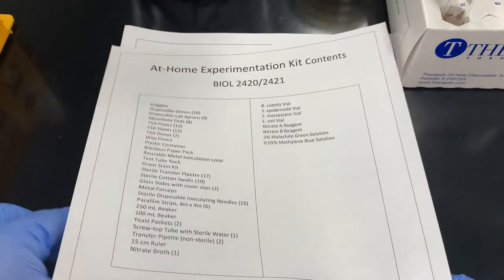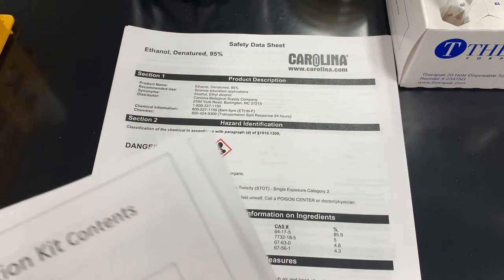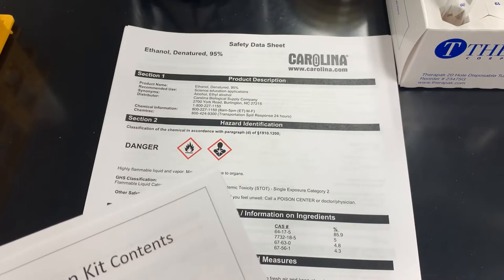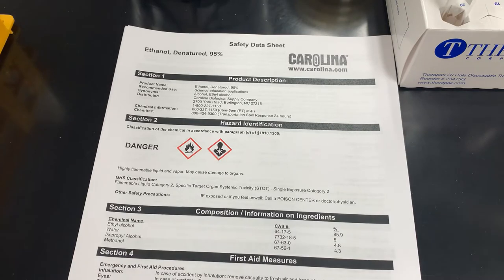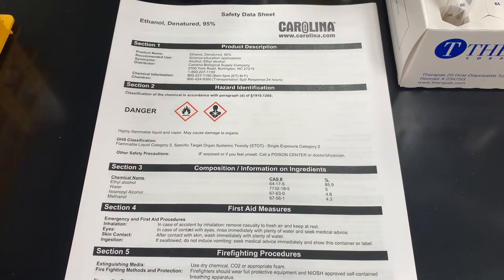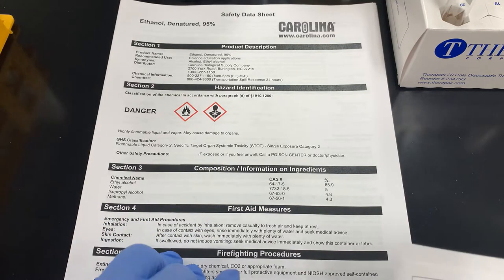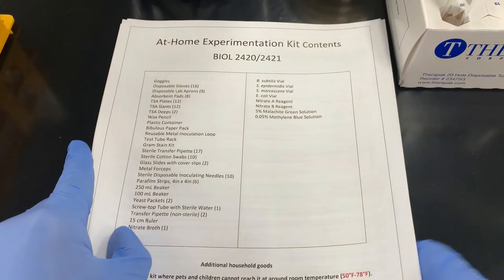After that, you're also going to find the safety data sheets for all of the chemicals in the lab kit. Now, these are also going to be available online, okay? But if you need, here's a paper copy. Specifically, if any of this gets on your skin or in your eyes, they have a section specifically for how to deal with that, okay? Spoiler alert, it usually is wash with water heavily, okay? So make sure that you read through those if you have any worries.